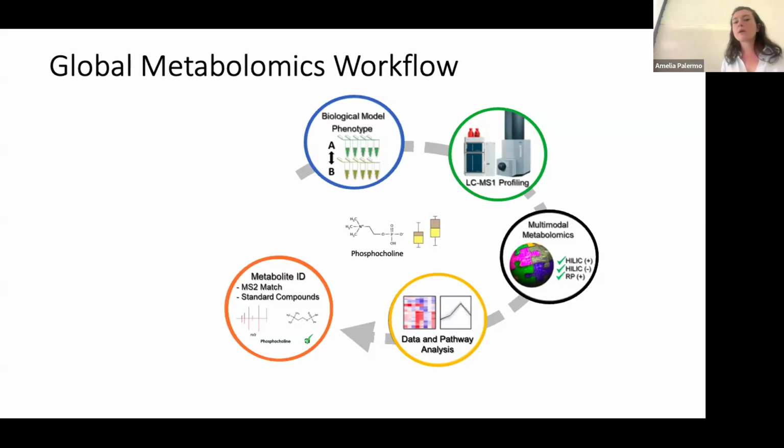The reason why we do that is because it has been shown from previous studies that a specific molecule exposed to energy that fragments it will break into fragments that are very characteristic of the original molecule. And by interpreting those fragments and by measuring the overall mass of that molecule, we can infer structure and we can get back to the identity of the metabolite.